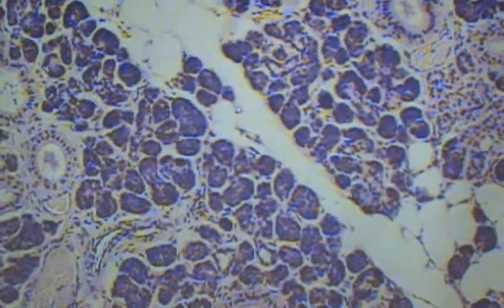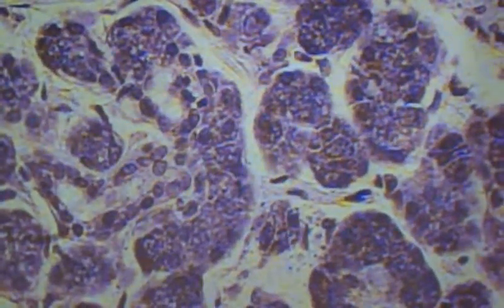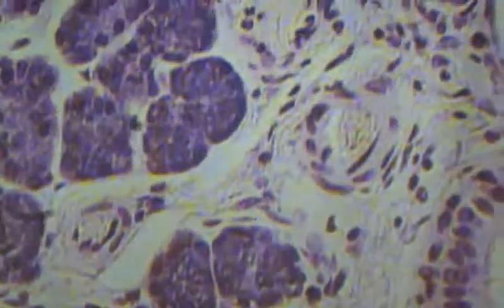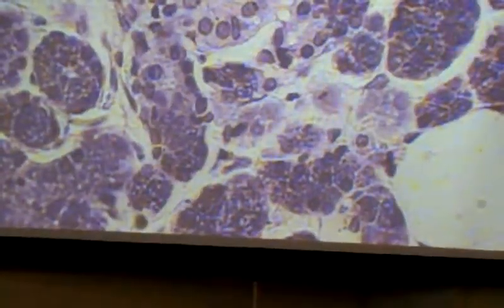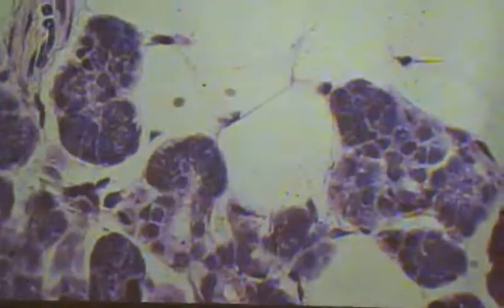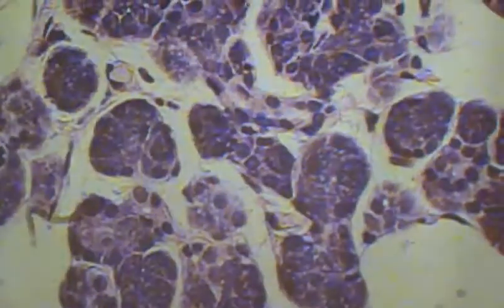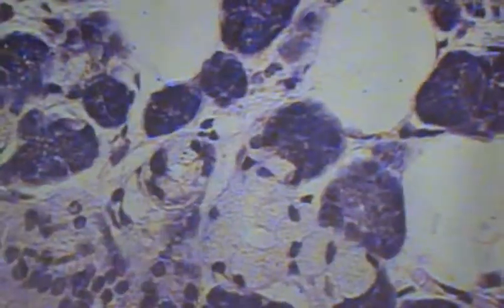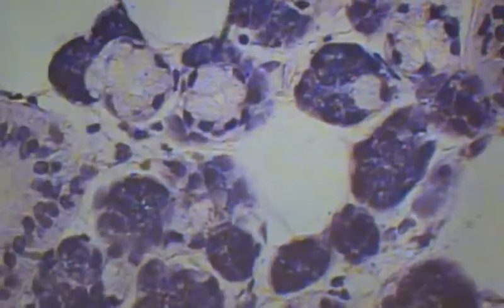I'm going to go all the way to Hightower. And as I search around, I'm going to try and spot you a textbook perfect example of a demi-lune. I do see some, but finding a really good one can take a while sometimes. Ah, that'll work.